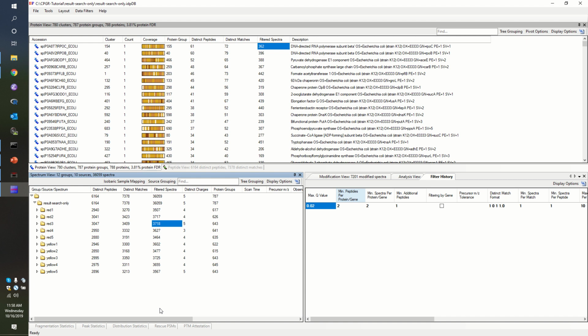It's usually using a top 8 or top 15 kind of model where it says which ions produce the highest intensities in the MS scans, produce tandem mass spectra of those, unless I've seen them recently. That's the algorithm. So which spectra get captured in a given mass spec run is quite random, seemingly so. It's at least complex and chaotic. So it stands to reason that there's going to be some amount of variation in how many spectra get identified in a given run.